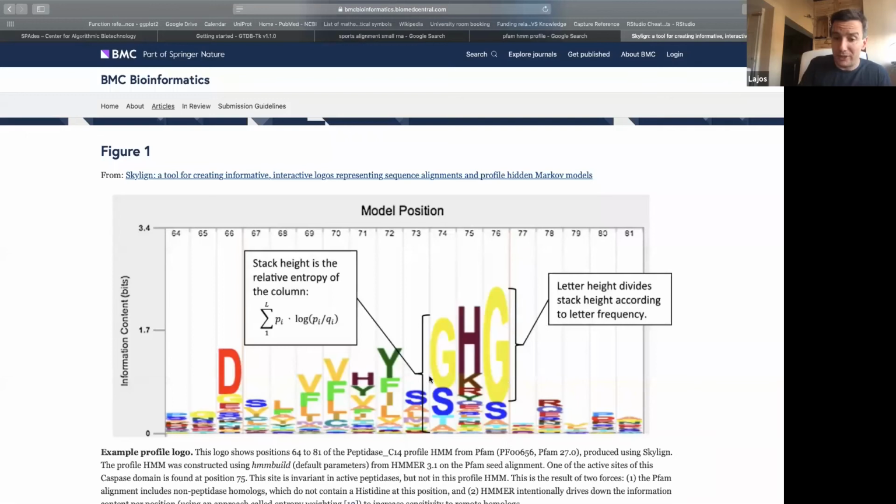To build this up, you need a lot of known genes. So if you want to build up the DnaA bacterial gene, you need at least 100 or 200 or 1,000 genes and protein sequences from different organisms. And then you can extract all of these position-specific residue probability informations.